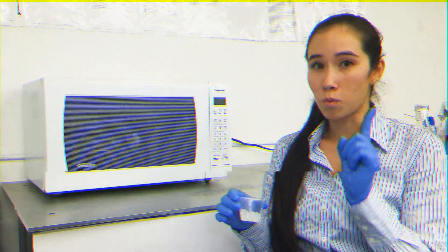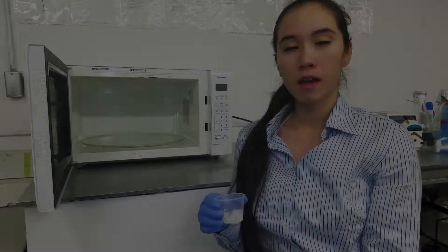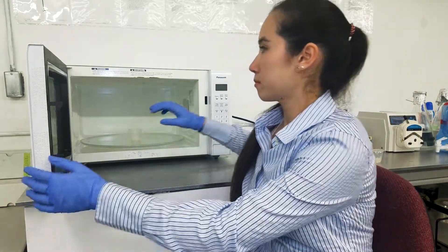One gel cup makes one gel. Place the cup into the microwave. The microwave time depends on the microwave, but we generally start with 20 seconds.